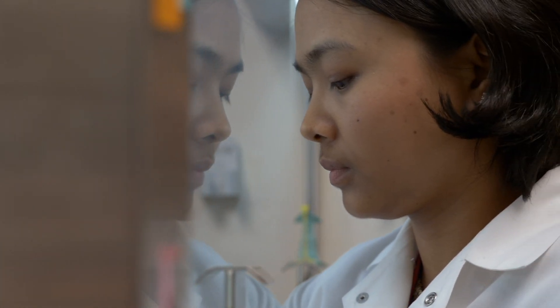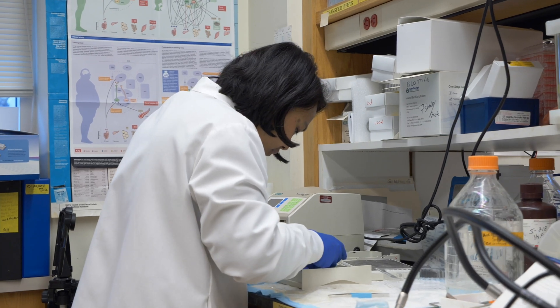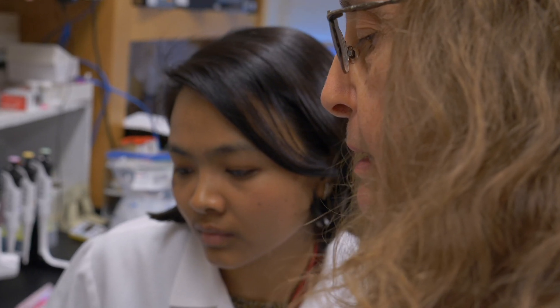The Voyager is just a lab tool, but it is a very good lab tool because it frees the PhDs to be able to do things that are more interesting than pipetting. We do enzyme assays, we do ELISAs, we do dot blots.